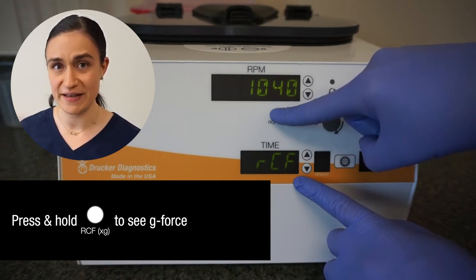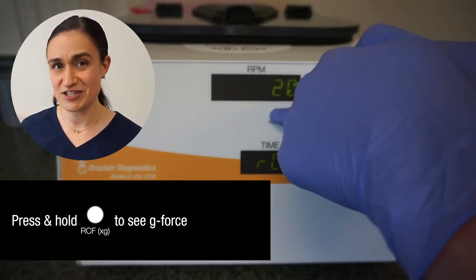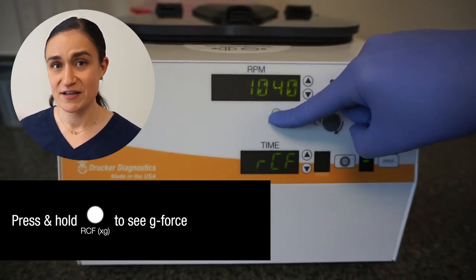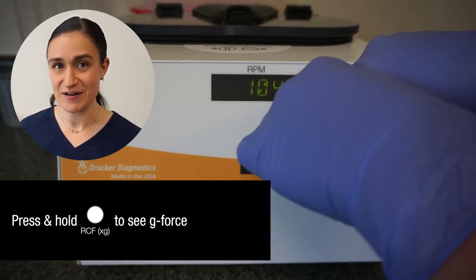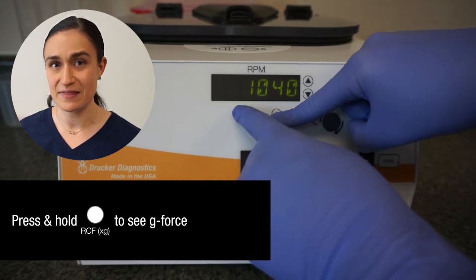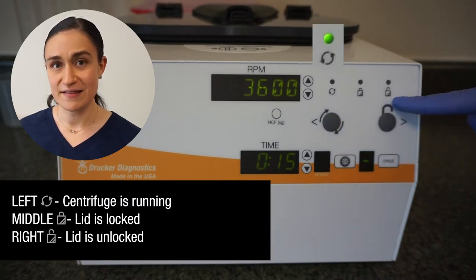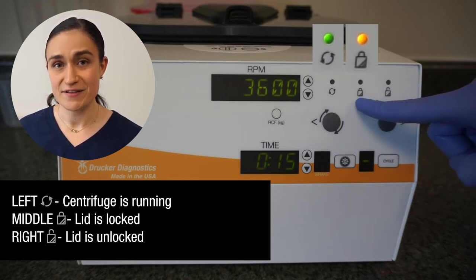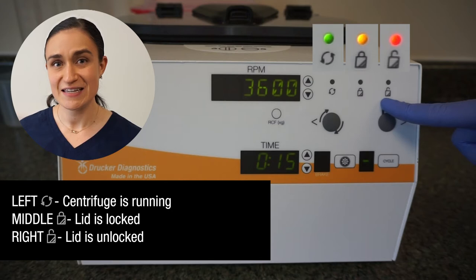When the g-force is displayed in the RPM screen, you can use the buttons to the right to adjust by g-force instead of RPM — just keep holding the button. Keep in mind that as you adjust either your RPM or your g-force, that number will change dynamically to represent the currently selected speed, so the currently shown value is the one that you will spin. To the right of that, we have our indicator lights. The left-hand light illuminates when the centrifuge is spinning, the center light when the lid lock is engaged, and the right-hand light to indicate the lid latch is unlocked.